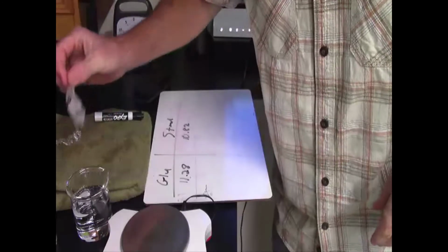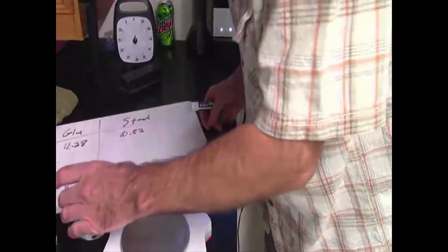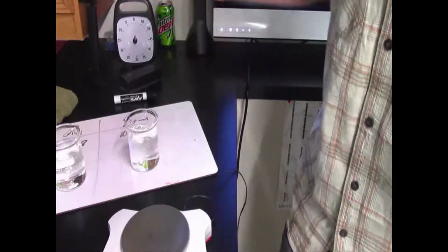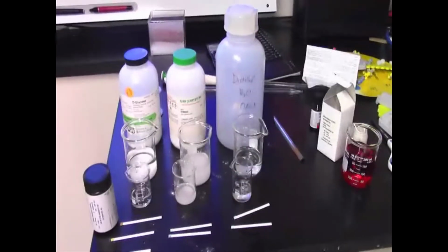And I put the starch bag in here, and the glucose bag in here. Keep track of them overnight. Here's the starch. Here's the glucose. And we'll come back tomorrow, dry them off, and weigh them and see which ones got heavier or lighter or what happened to them. What we're going to do now is we're going to do one more test to see what's going on here.